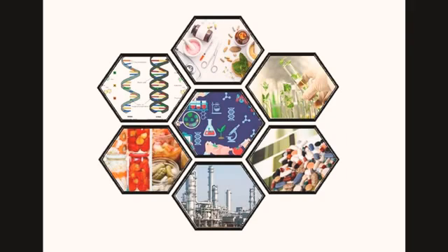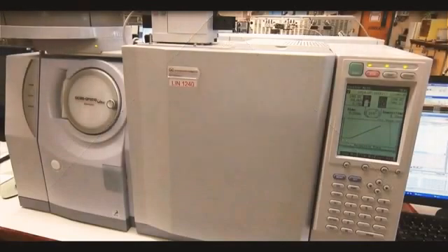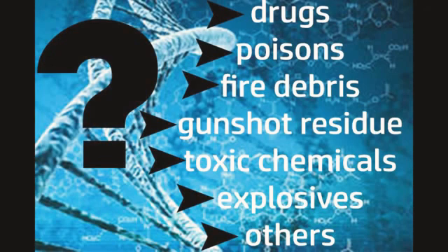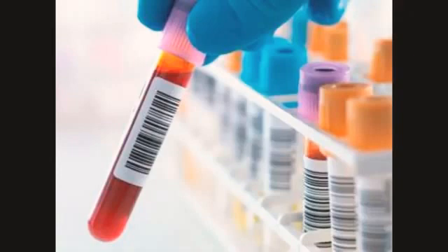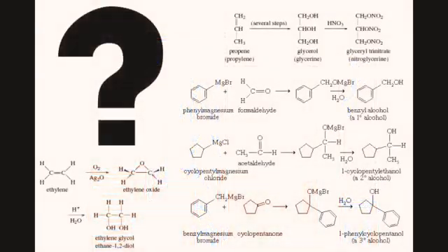A chemical analyzer is used to detect chemical compounds of interest or to identify the different components of unknown mixtures, for example drugs, poisons, toxic chemicals, gunshot residues, explosives, and even material samples obtained from the planet Mars. Some of the applications are identifying and quantifying unknown samples, identifying unknown contaminants, environmental analysis, identifying trace elements in samples, identifying gases in a sealed environment, and identifying residual solvents.